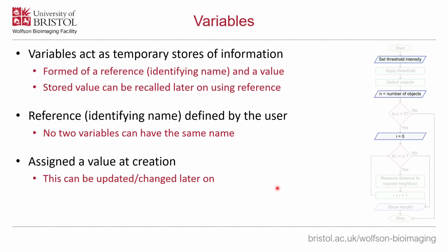Instead what you could do is you could assign a reference value, this variable, you could even call it radius, set that equal to 2 or 5, and then just leave that at the top of your macro, one of the first things that you assign in that macro. And then subsequently in the macro, all you would need to do is refer to that name, radius. So instead of writing 2, you would literally just write radius. And ImageJ would then be able to insert that in, and it means that you only need to change these values once.